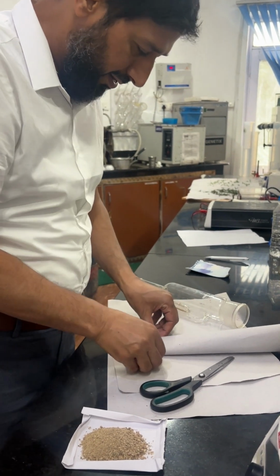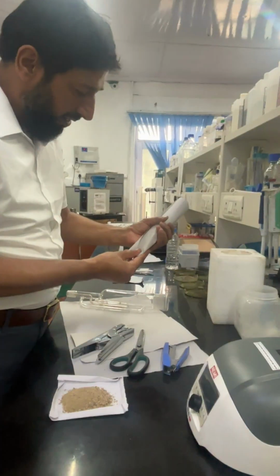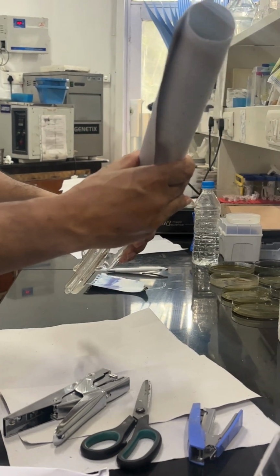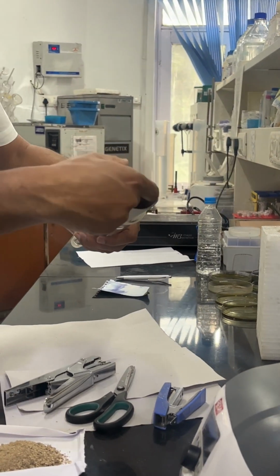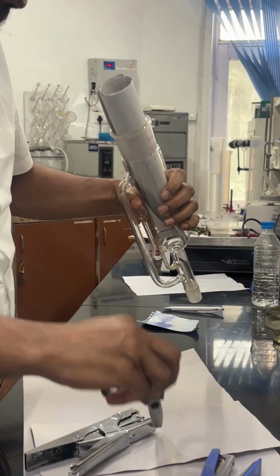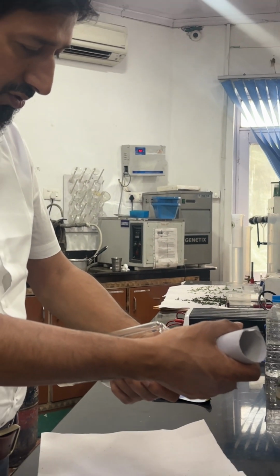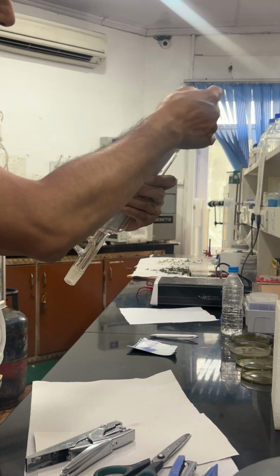So take it out and then make a double bend like this, otherwise it will not go. First we'll try it once and see that it goes inside. Now once inside, what we'll do, we have to fill it.